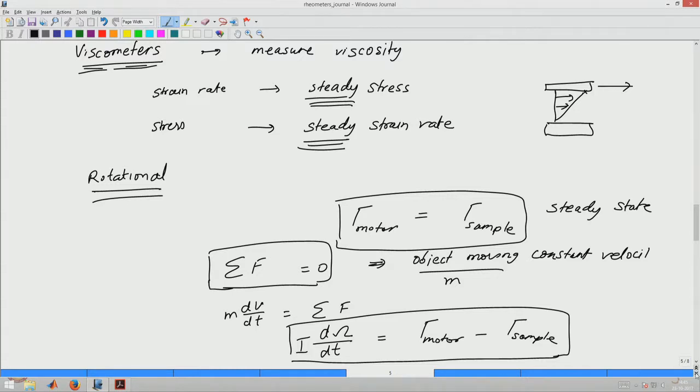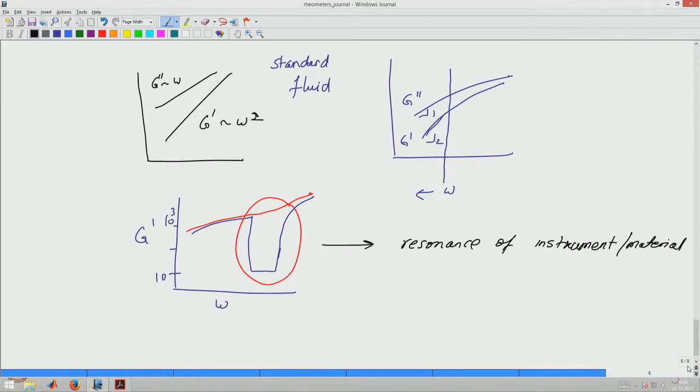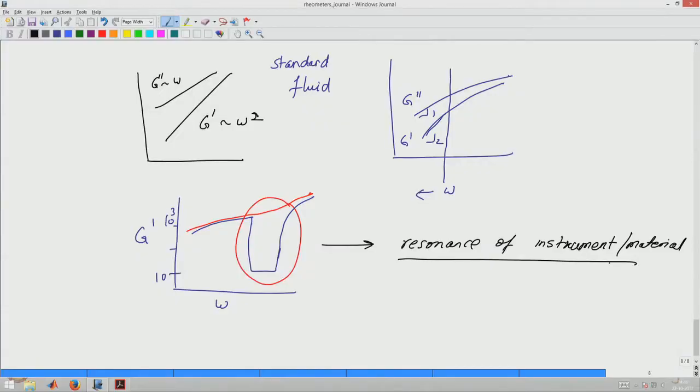You could show that for some instruments and for some samples you may observe this kind of a dip, but that does not mean that any dip you see is because of this reason. Okay. So, what we need to do is, for a specific set of samples and a specific set of instruments, you can do quite a bit of analysis to come up with such an understanding.